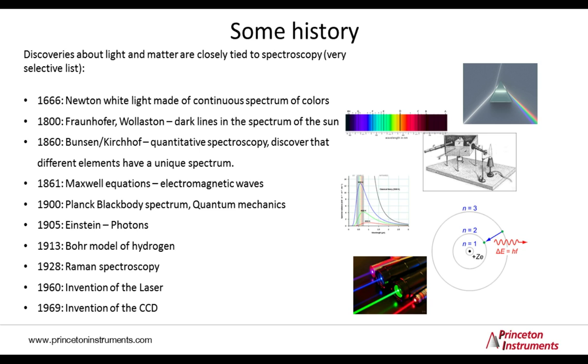The beginnings of spectroscopy, I would date back to Isaac Newton, who discovered that white light is built up of several colors by observing the diffraction of white light on a prism. Ever since, people looked at the spectral output of light in spectra, and the theories of light and elements began to form in the 18th and 19th century.